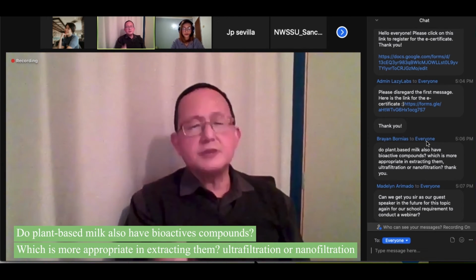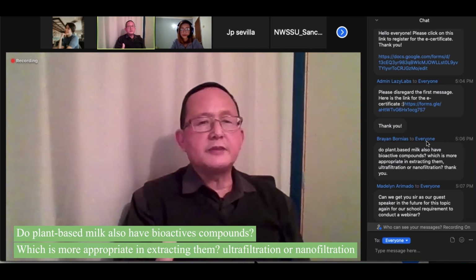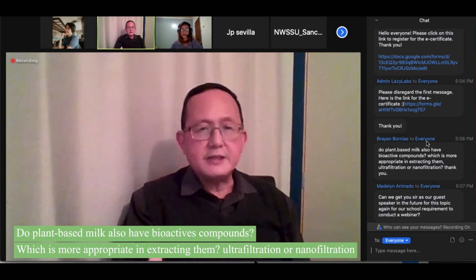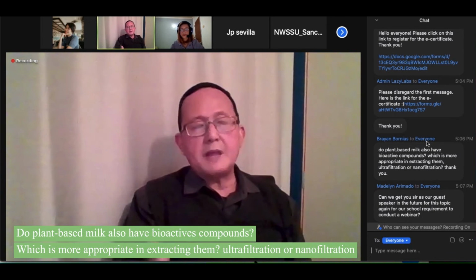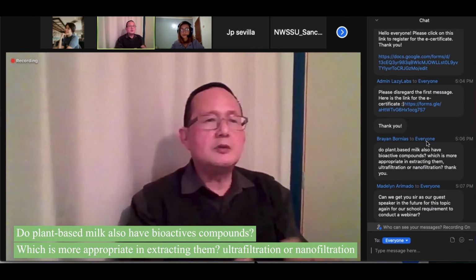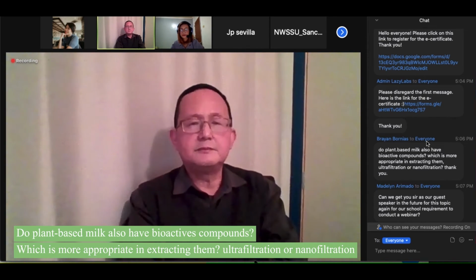Ultrafiltration is used for separating whey proteins, the smaller proteins. You use ultrafiltration for that. You will use nanofiltration once you break up the whey proteins into smaller sizes. I'm not very familiar with plant proteins, so I could not really explain it fully. But if it behaves similar to whey proteins and then to peptides after enzyme hydrolysis and so on, then it could be applied as well.